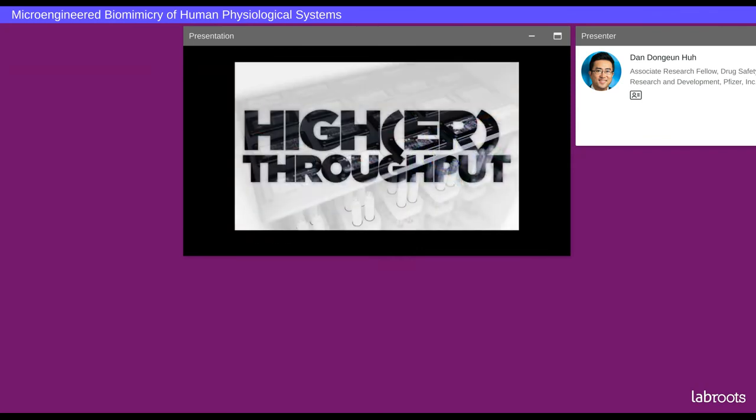So before I finish, let me just spend a minute or two to talk about a new direction, a very exciting new direction we've been exploring over the past 3 years or so. Hopefully, I was able to convince you that organ-chip model systems are great in that they allow us to mimic the complexity of human physiological systems. But the flip side is, it's not very easy to work with these systems. It's a lot of work to develop these model systems. It's also a lot of work to maintain these tissue layers for long periods of time for experiments.